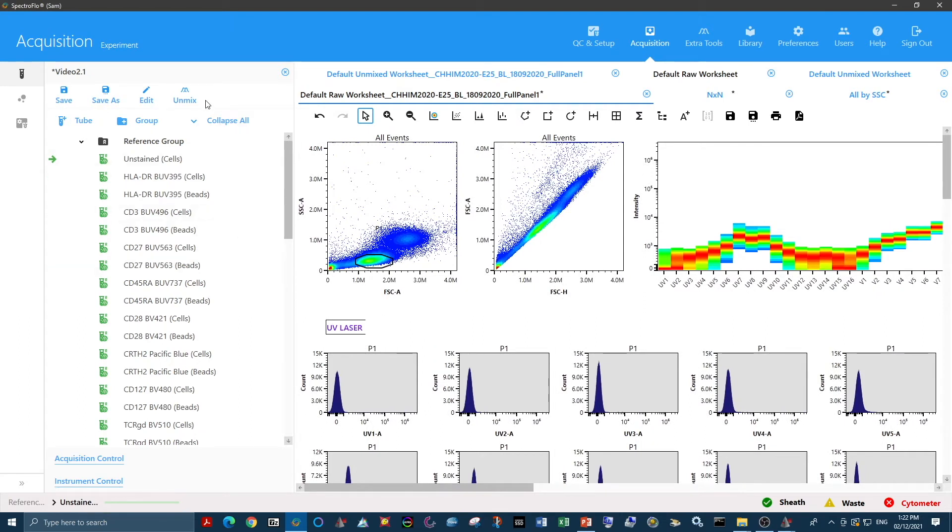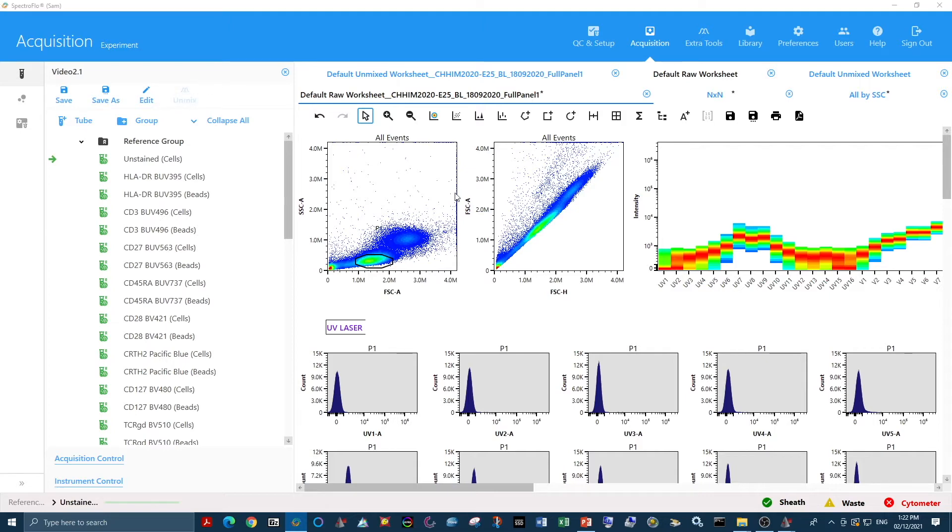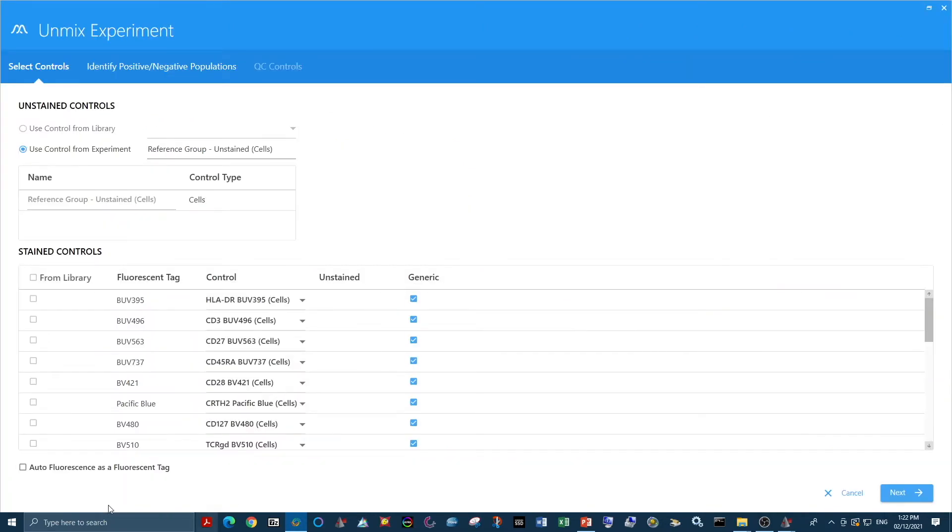To do this, all we do is go to the unmixing wizard and select autofluorescence as a fluorescent tag, and this will extract autofluorescence from all of our samples.